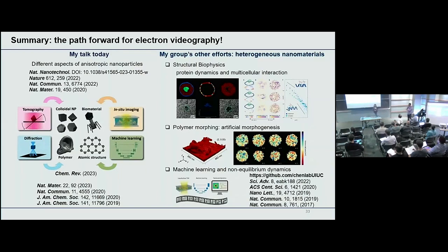Right. First of all, most of the movies are real time. The self-assembly is really quick because those are nanoparticles. They diffuse very quickly. But there's actually no real limit in terms of observation window. So for example, if the self-assembly takes hours to complete, there's no problem at all. And second, when it comes to how they can relax into order, I think the ultimate question is how to really escape kinetic traps in the system.